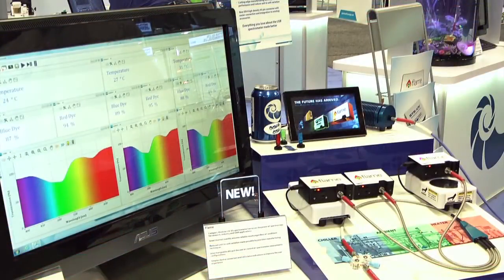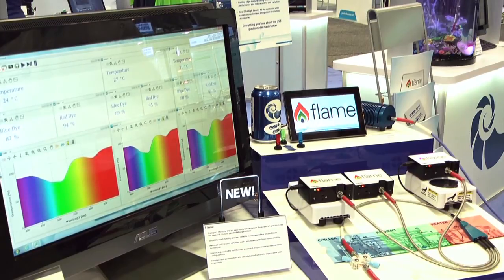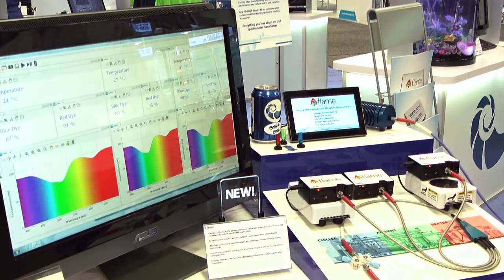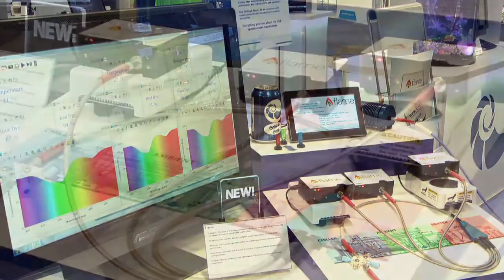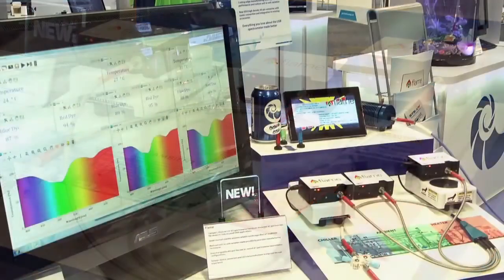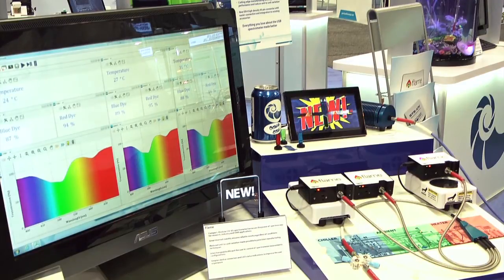What we see here is a mimicking of the production process environment. To showcase the thermal stability and unit-to-unit tolerances of the flame spectrometer, we've developed a trade show demo featuring a cool ambient and heated environment where spectrometers operating at different temperatures give the same performance.